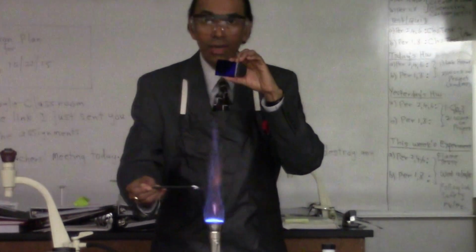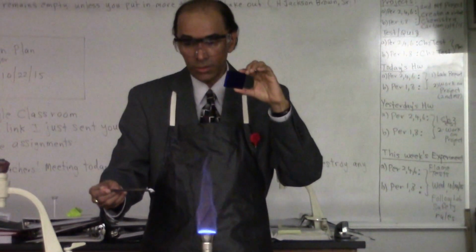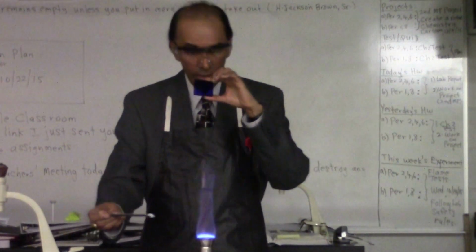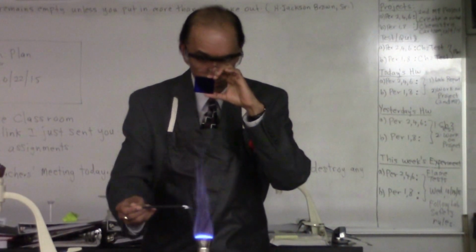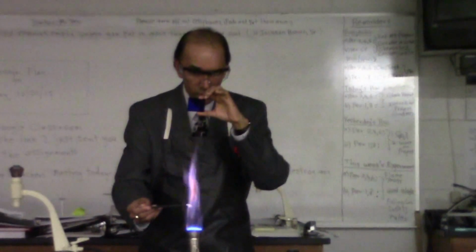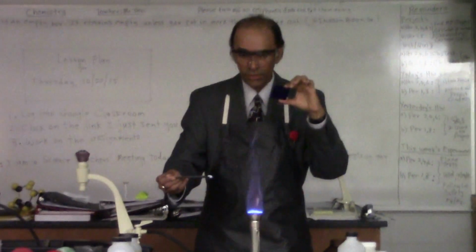And then I look, and I hope you have the opportunity of trying this experiment, and you'll see something a little different with the naked eye and with the cobalt blue glass. Okay? Much sharper color. Looks far more pink with the cobalt blue glass.